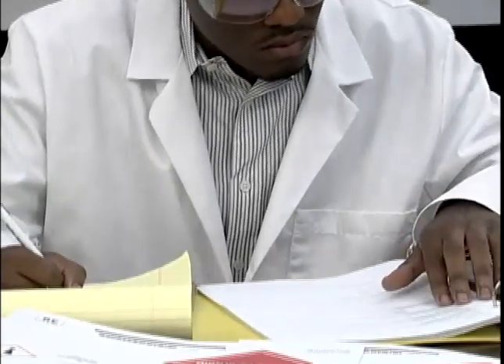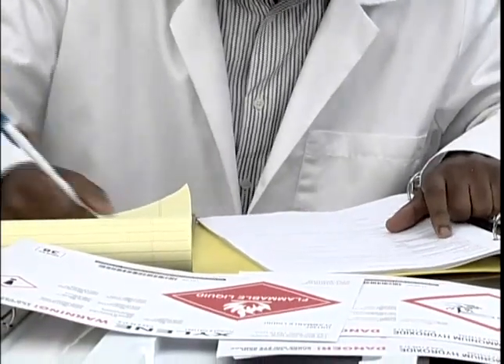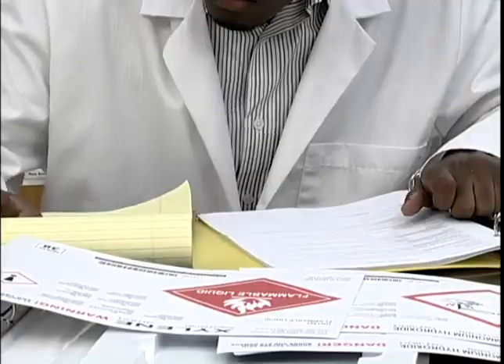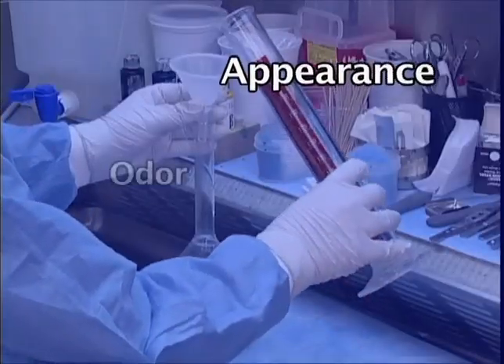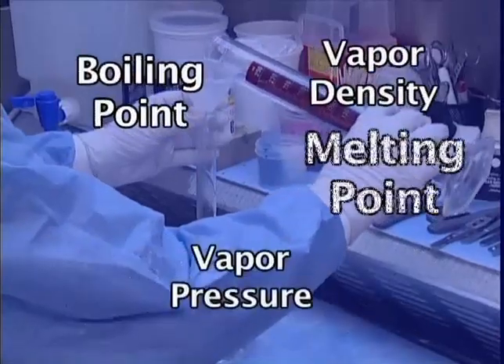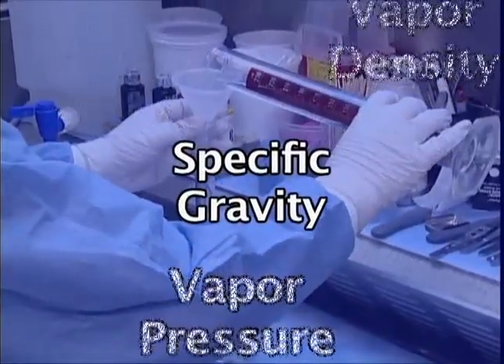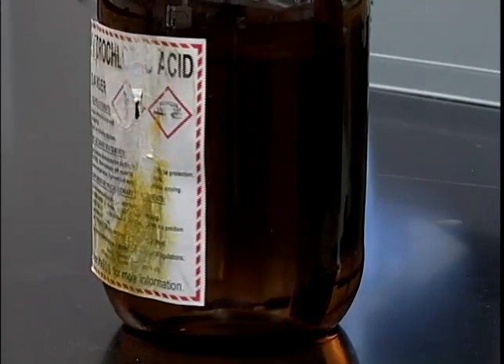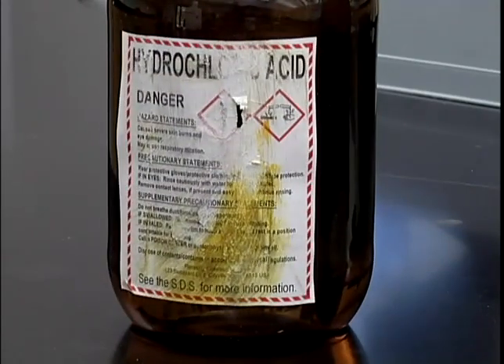This information is important for evaluating the use of a material for a specific purpose and can help to determine what precautions should be taken when working with the chemical. Your employer will also use the chemical and physical characteristics listed in this section to help determine the safest work practices for your facility. The information can be helpful in identifying a chemical when its container label has been damaged or destroyed as well.